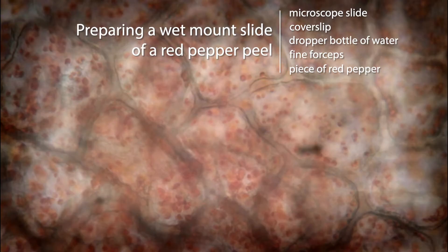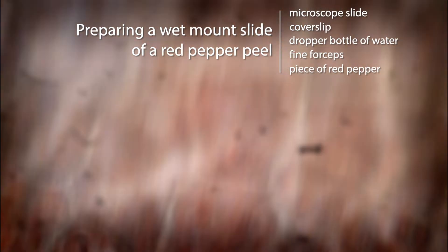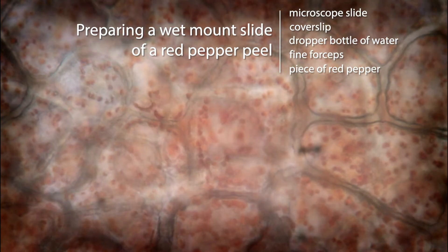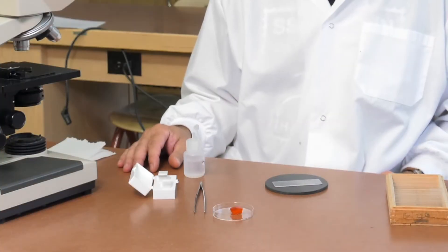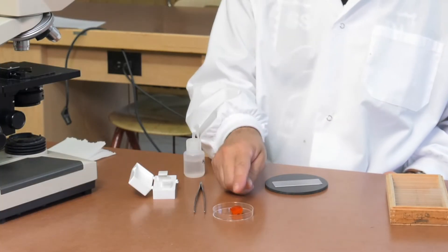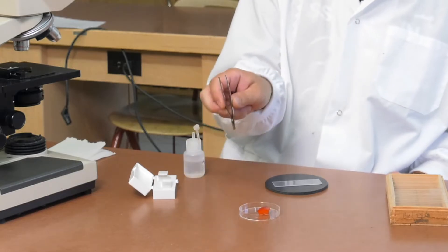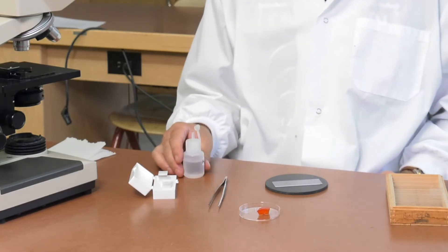Hello and welcome to the tutorial video for preparing a wet mount slide of a red pepper peel. In addition to slides and cover slips, you will need a piece of red pepper and fine forceps which will be provided at the side bench.